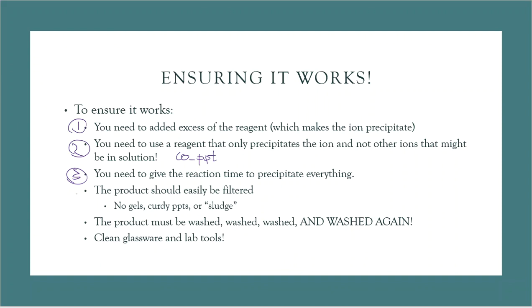Next, number four, the product that you get from these gravimetric analysis procedures has to be able to be filtered.